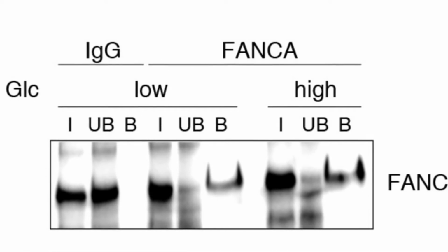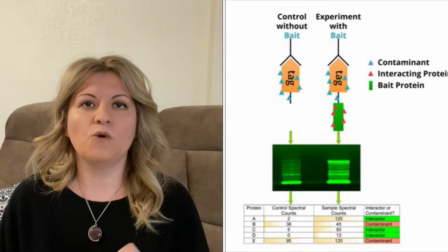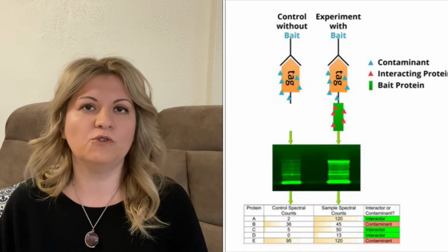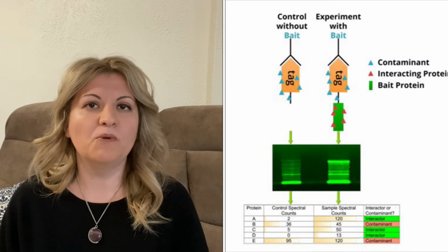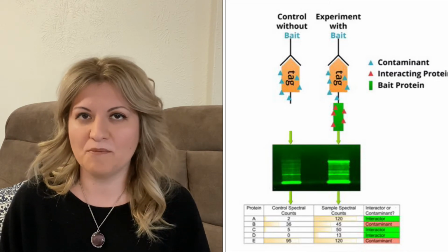So something to think about. Negative control really has to be negative, meaning clean, nothing there to be seen. Another important thing is having a good antibody that is going to capture your protein of interest, called bait. If those antibodies are not good, your protein will not be pulled down from the sample, meaning that you're not going to be so happy, as you will not get the results you want.